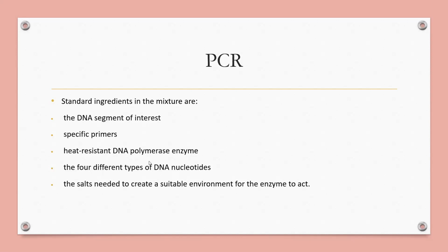Next, heat-resistant DNA polymerase enzyme. Taq polymerase is preferred as it can withstand high temperature. In the hot start protocol, DNA polymerase is added after the heat denaturation step of the cycle.